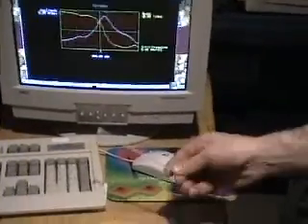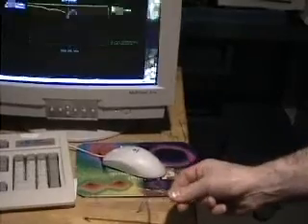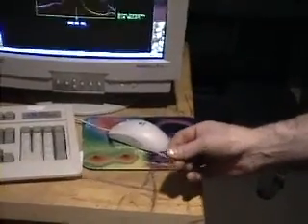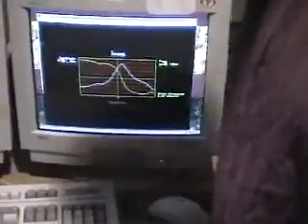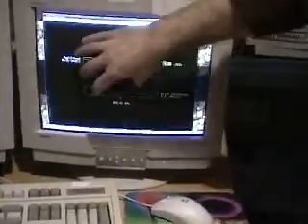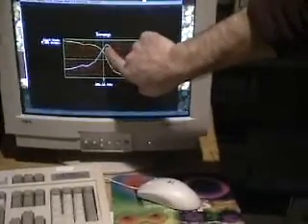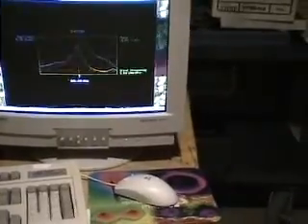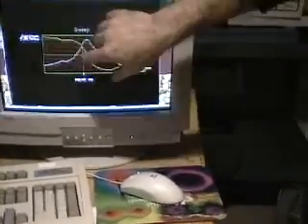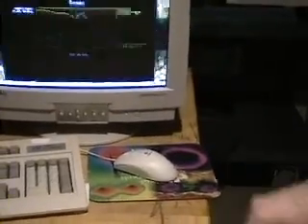But in fact, when I get close to the sample and start hitting it the way I am going to when I'm in tapping mode, that's kind of like a damping force. And the damping force tends to shift the resonance, this whole resonance spectrum, down to lower frequencies. So we always pick a point that's slightly to the left of the peak, so that when we're in the actual operating range, hopefully the peak will shift to align with our operating frequency.